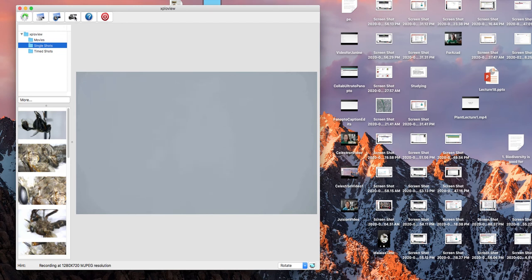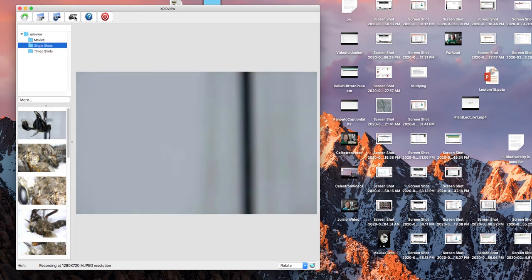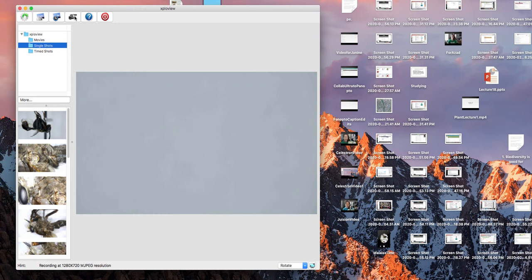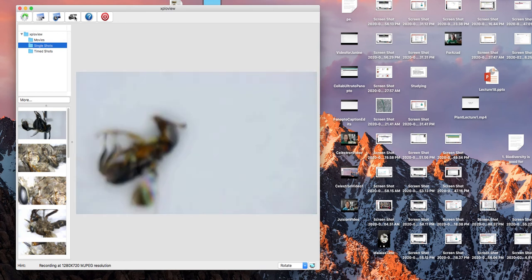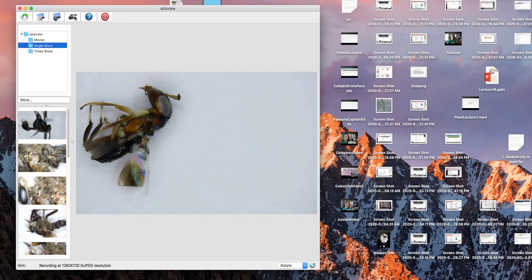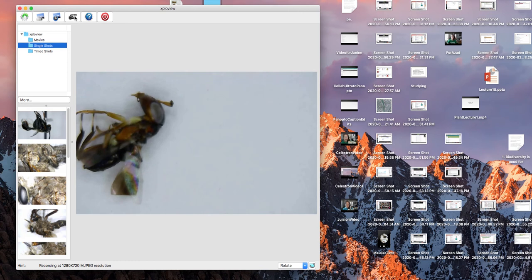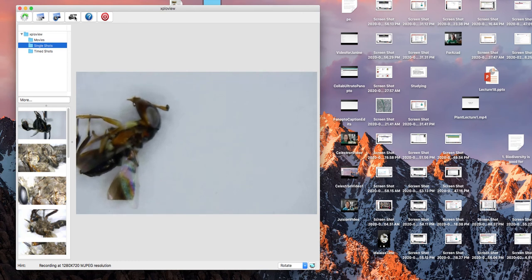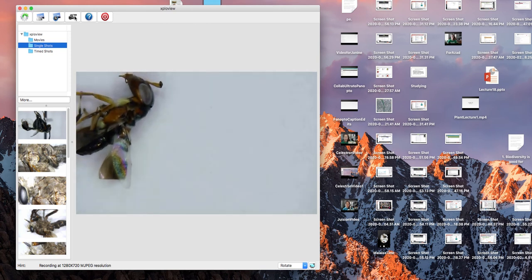This wasp is probably only, let's see if I can find the wasp I was using. This is probably closer to two millimeters, this insect right here. Oops. Inevitably you're going to do this. I accidentally knocked this off of the mount. So I'm going to have to repoint mount this. This is something you should be aware of. And again, this is largely because you do have that little plastic ring around the microscope. Something to be aware of, something to warn your students. You have to be aware of that plastic ring and make sure that you don't accidentally knock your insects off of your point mount.